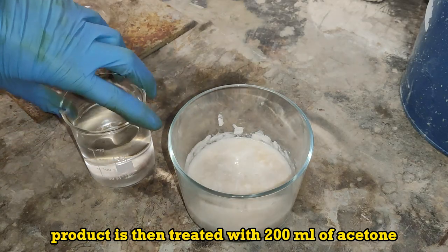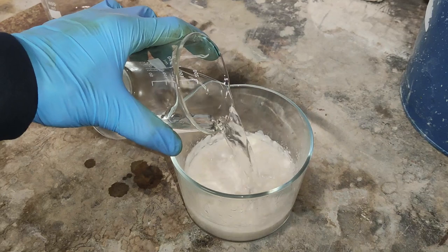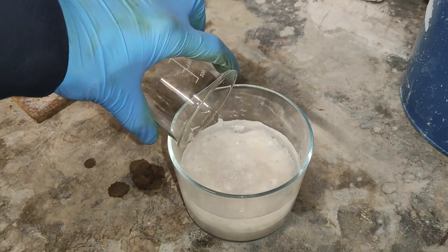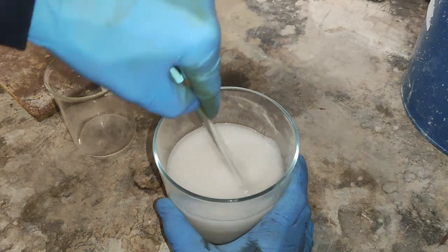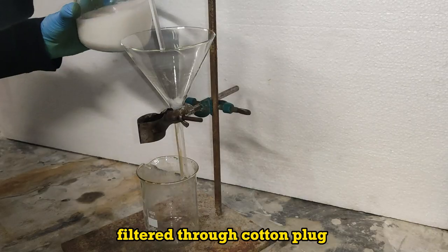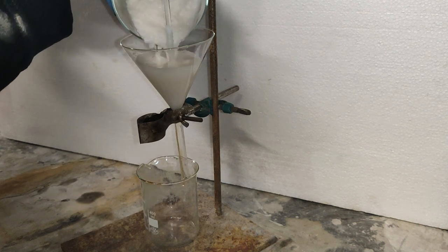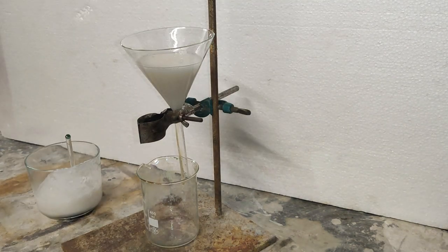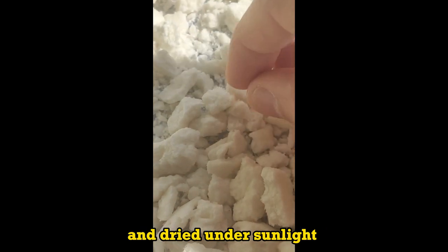The product is then treated with 200 milliliters of acetone, filtered through a cotton plug. The residue is pressed on paper and dried under sunlight.